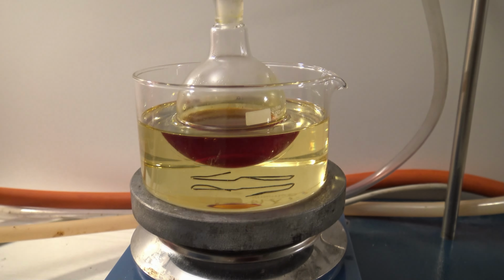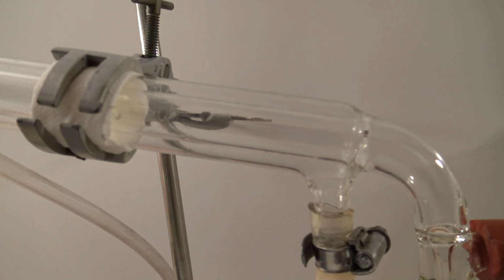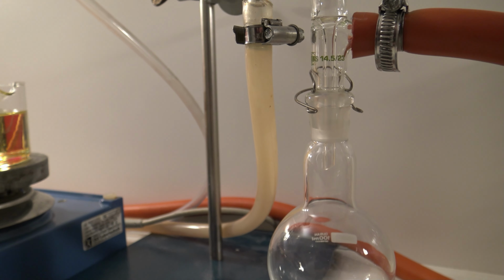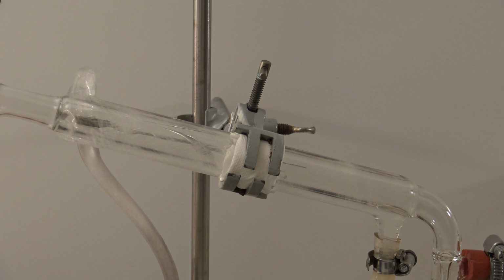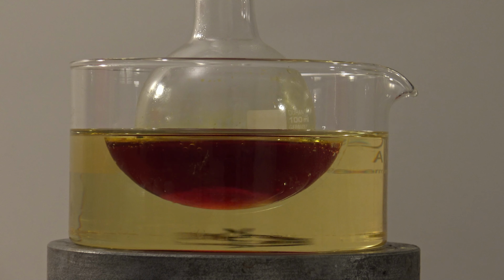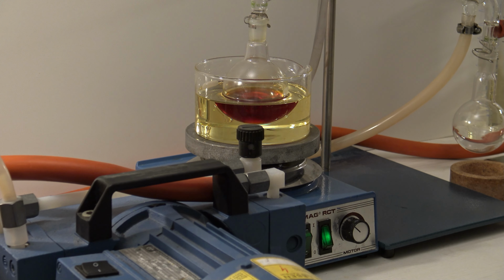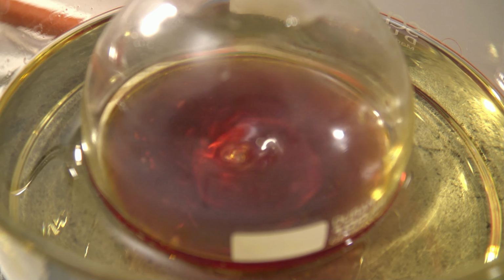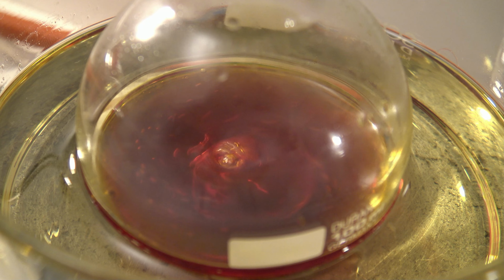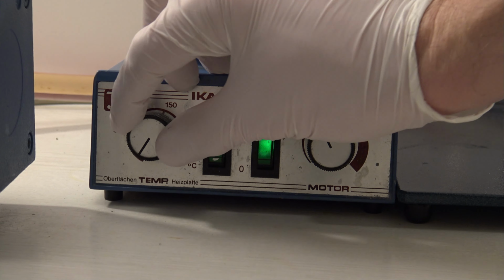The only difference to a simple distillation is in the vacuum pump, which is connected to the vacuum adapter. The water and the stirrer were turned on before the vacuum pump. This ensures that a flash boil is not likely to happen and vapors could condense. Often traces of low boiling solvents begin to boil immediately after turning on the pump. In this case, most of these were distilled off before. Only then the hot plate was turned on.